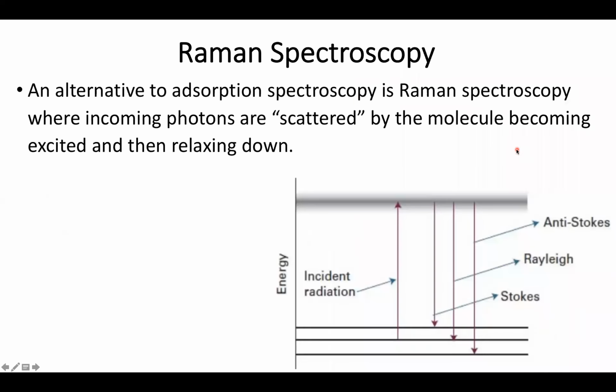Raman spectroscopy differs immensely from traditional absorption spectroscopy. For absorption spectroscopy, a photon comes in, excites my molecule to some new state. I measure how much of the light is absorbed. Congratulations, we can figure out, based on the radiation of absorption, the difference in energy between two states.